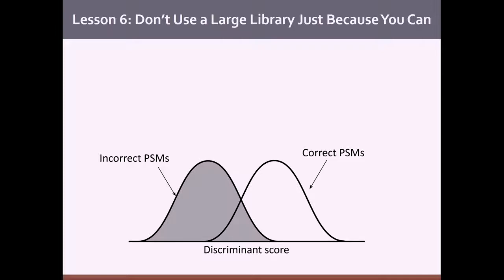And everybody talks about the occasional times you get the odd few peptides because of that, but people don't really talk about the things that they lose because of that. So let's just assume you have here the incorrect PSMs and your correct peptide spectrum matches, or in this case it's peptides.